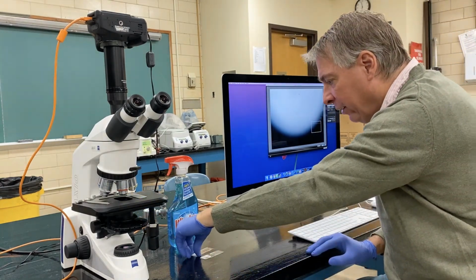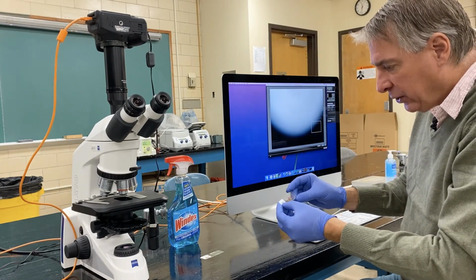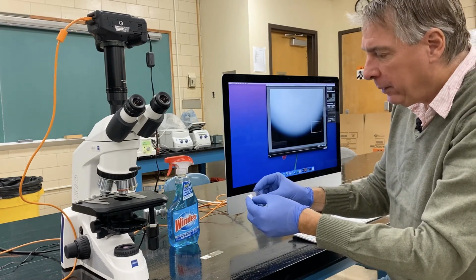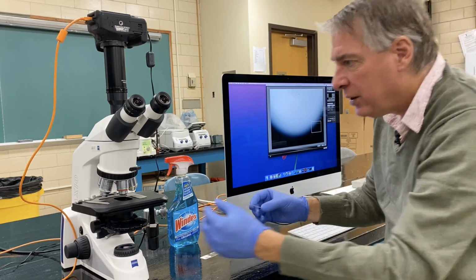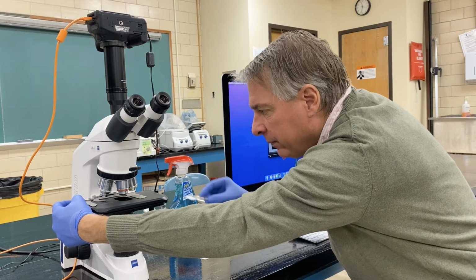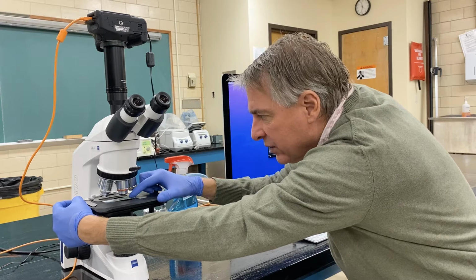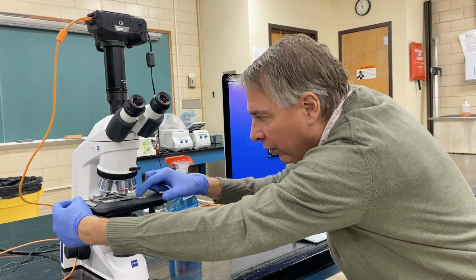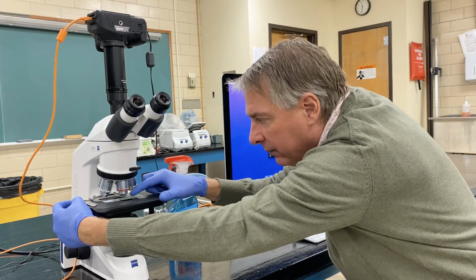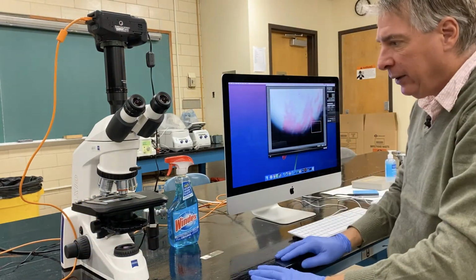I have a slide here that I picked out of the slide box that I wanted to check out. It's called Muscle Types, and it looks pretty cool from a bird's eye view. I'm going to place it on the microscope stage by pulling back this spring lever and setting the slide on the stage and sliding it in such that the slide is up against the right-hand side of the slide holder and against the back edge as well. Then I can release this spring lever, which will hold the glass slide in place.